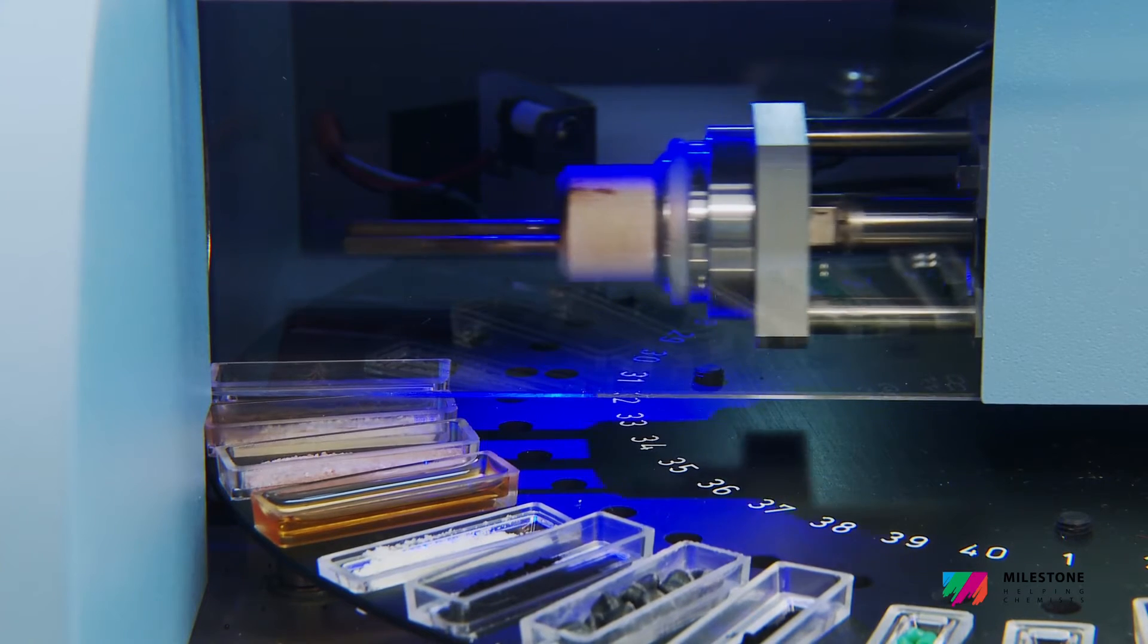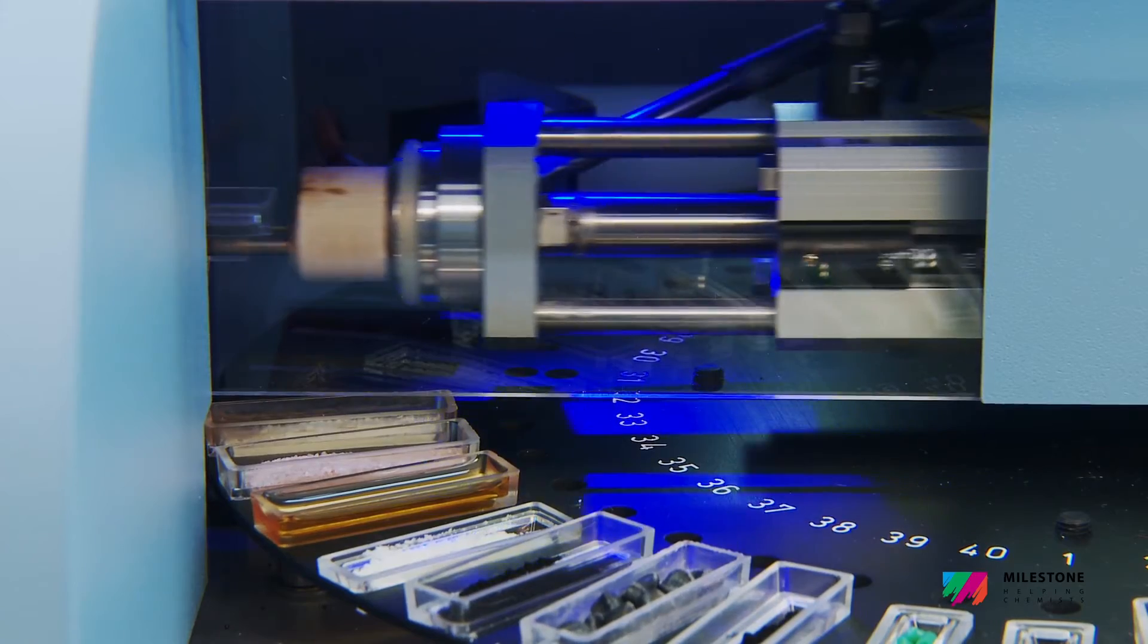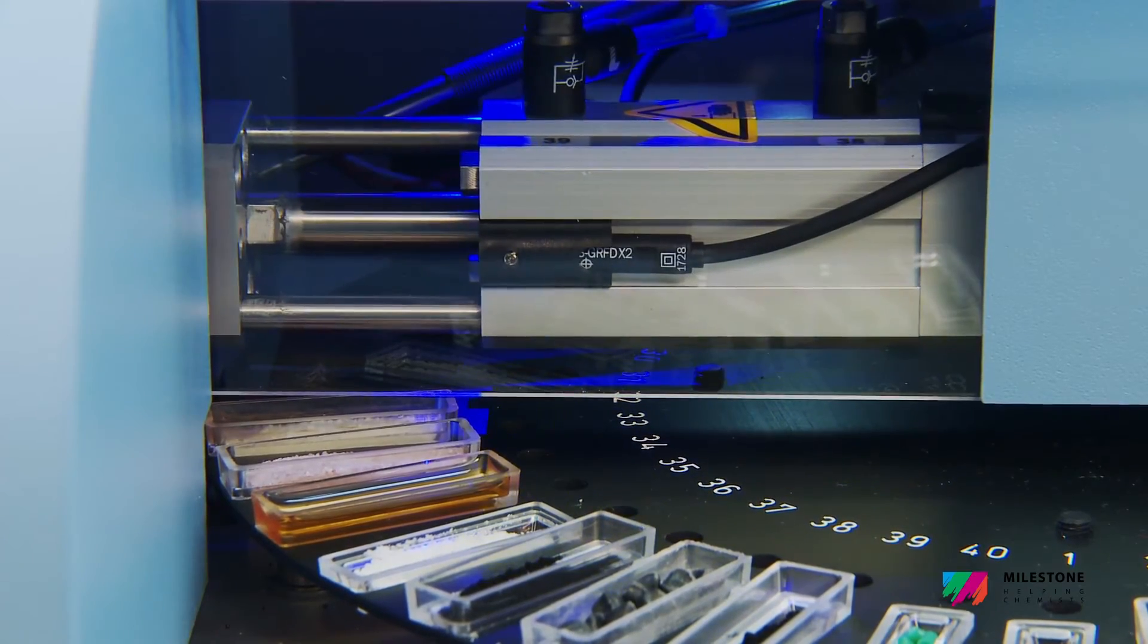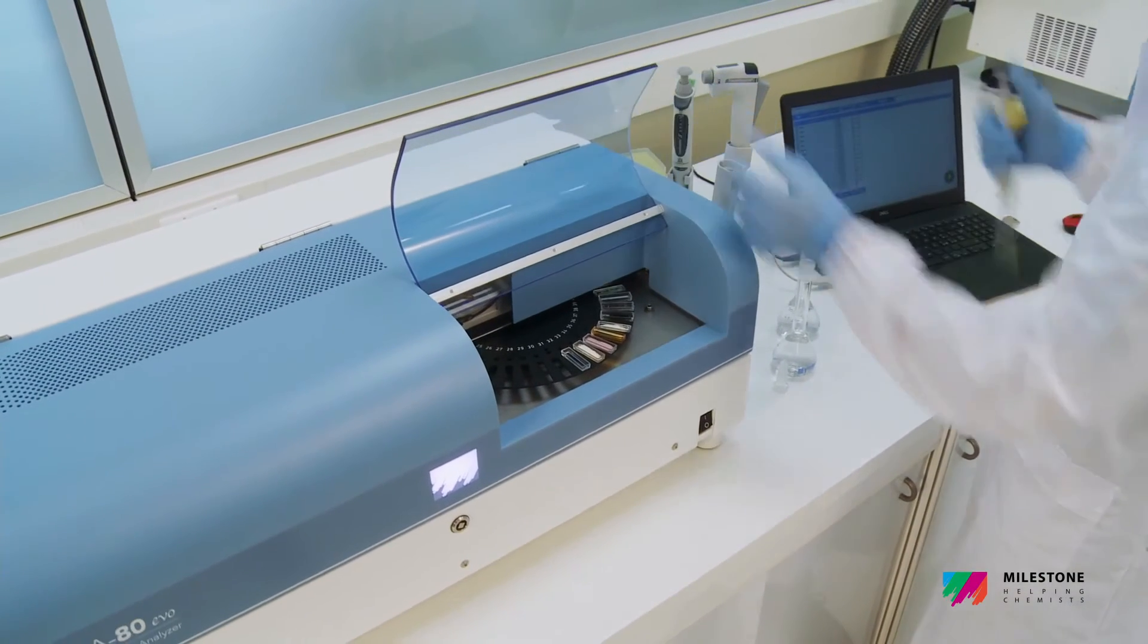With the DMA80 EVO, sample preparation and method development are unnecessary, as it directly analyzes solid, liquid, and even gas samples, removing all the challenges related to interference and memory effects.